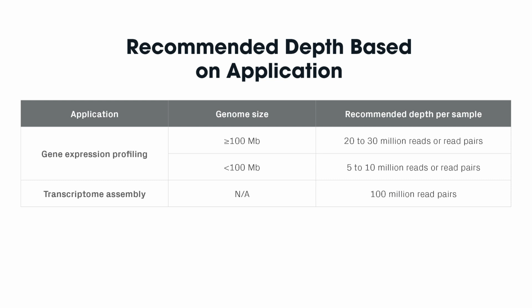When performing deeper sequencing with minimal input material, consider using UMIs, or unique molecular identifiers. PCR does not copy cDNA libraries with perfect fidelity. It's often biased, amplifying some molecules more efficiently than others, and it can also introduce errors or mutations.